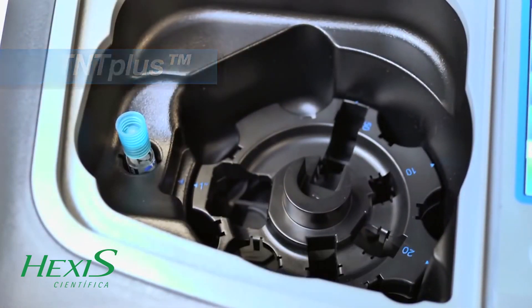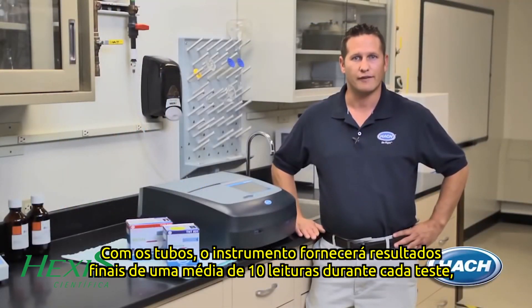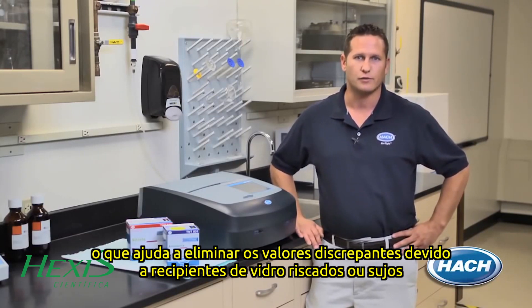There are additional benefits when using TNT plus reagent vials with the DR6000. The instrument will provide final results from an average of 10 readings during every test, which helps eliminate outliers due to scratched or dirty glassware.